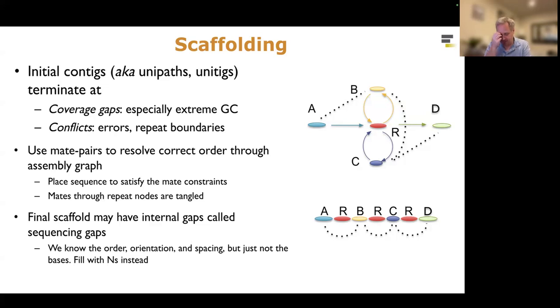In the case of the human reference genome to this day, if you're not using the T2T reference, you'll see that chromosome 1, for example, begins with N, N, N, N, N, N, N, N, where we know that there should be additional bases there. They just haven't been assembled. They weren't resolved in the references available. So be careful when you do scaffolding that those N characters will be parts of the genome that have just not yet been fully resolved.